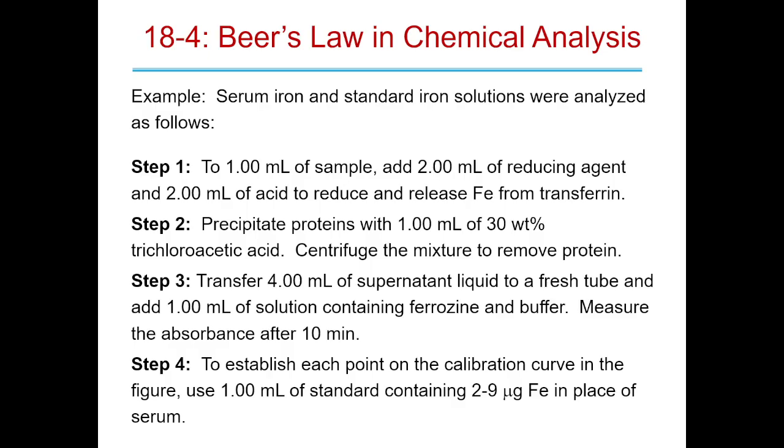So you're going to plot the Beer's law. You can then use the absorbance from your unknown, and you literally just put that in the Beer's law. You'll have all the other terms, and you plug in the absorbance, and that'll give you the concentration. And then the error of that measurement is the error of your Beer's law curve.